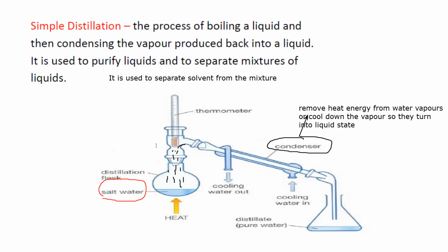So when you supply the heat energy to a salt solution, like here we have a salt solution, this water will evaporate and form water vapors. As these water vapors rise, because hot vapors always rise up, they are losing some of the energy, but still in the vapor form.